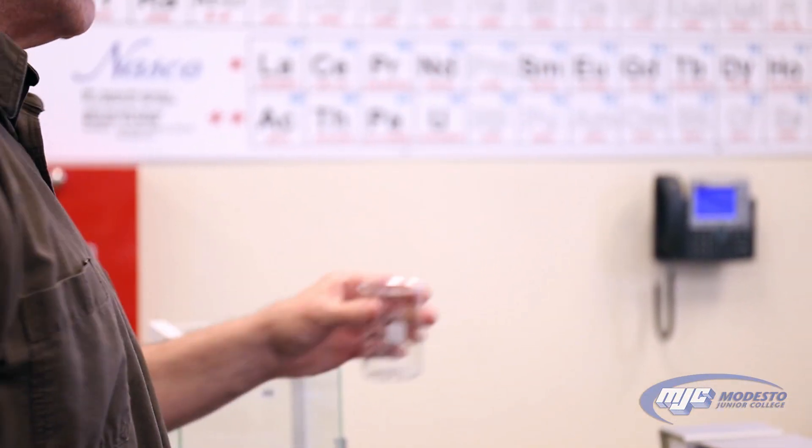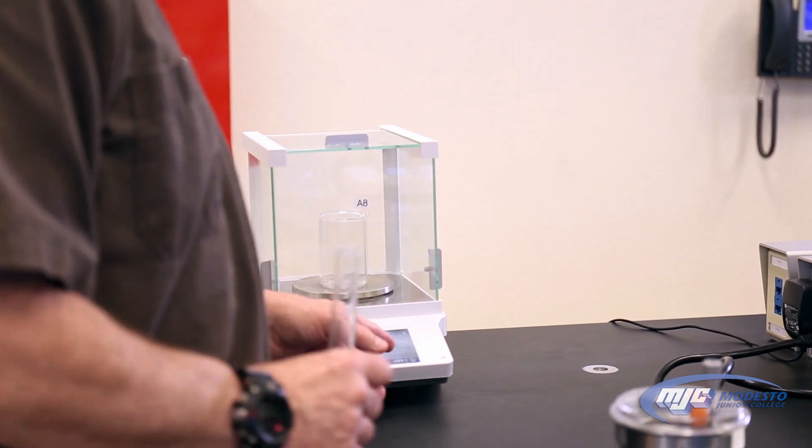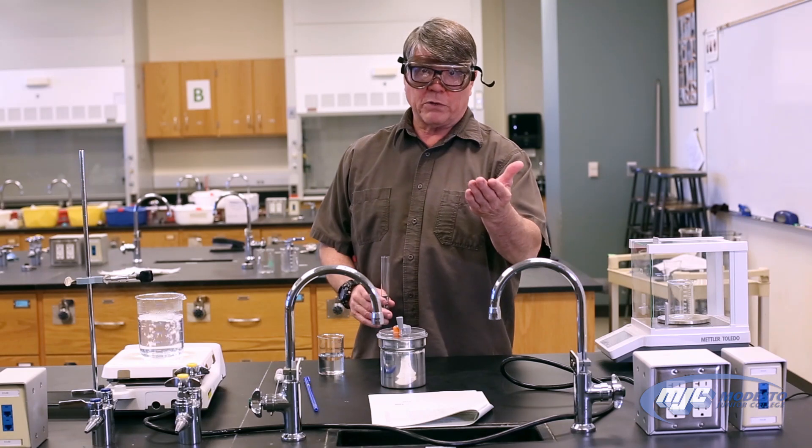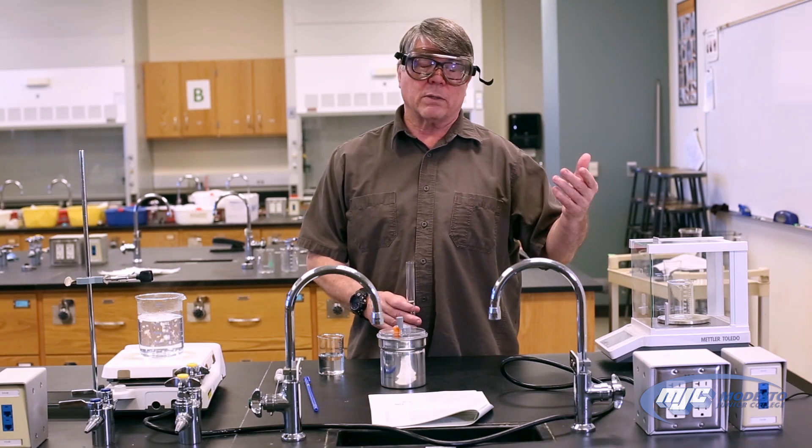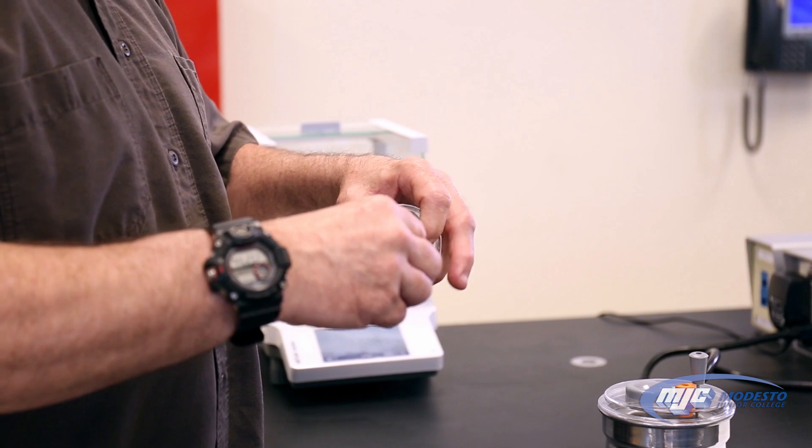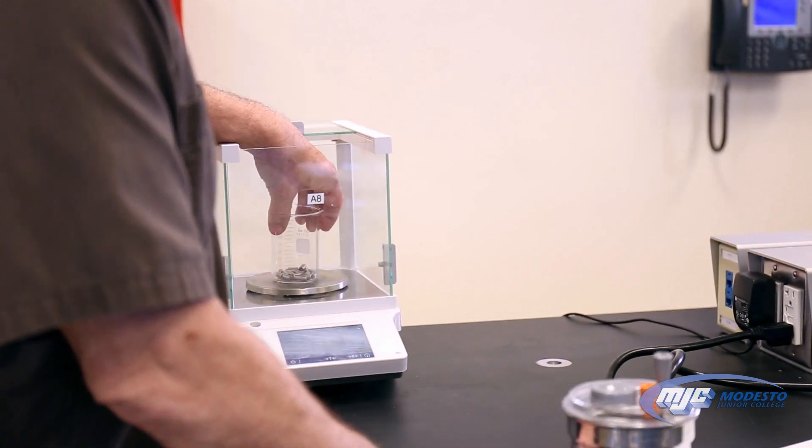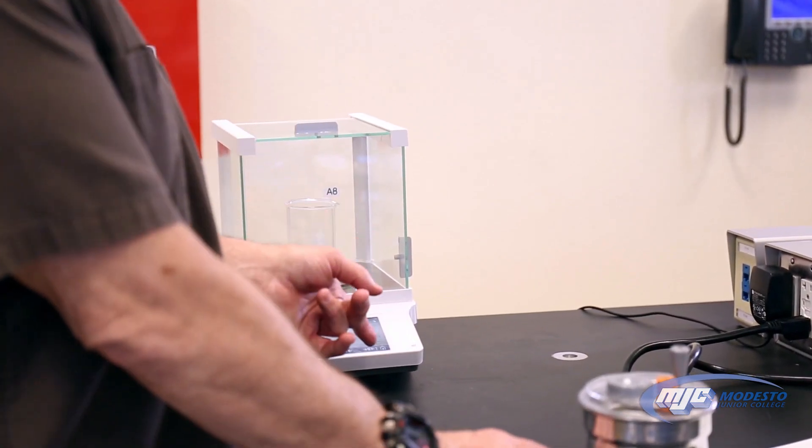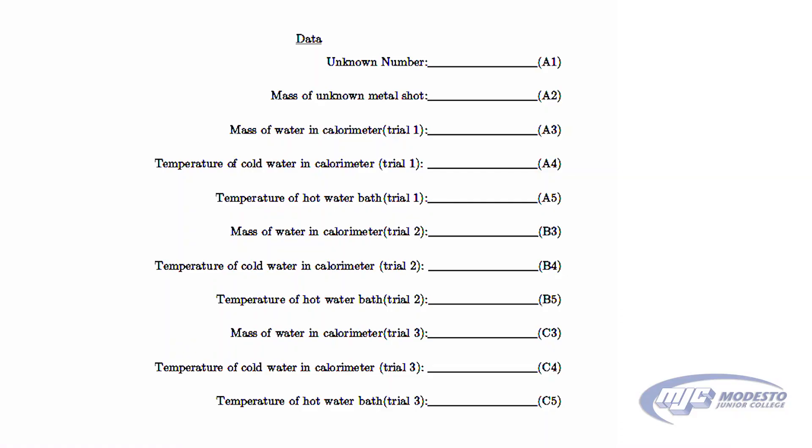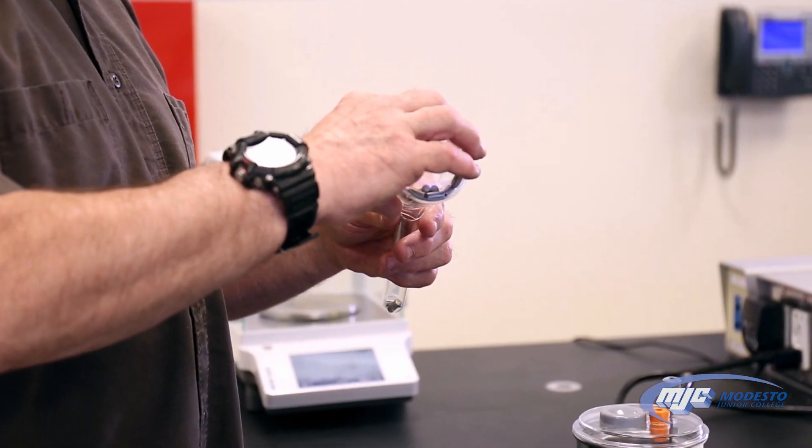So the mass of the metal. What we do is we take a 150 milliliter beaker, put it on the balance, and tare the balance. Should read zero with the empty beaker on there. That way what it's doing is it's subtracting the mass of the beaker for us. So we take the beaker off because we never pour anything directly under the balance. And carefully, so as not to break the beaker, we pour the metal shot into the beaker. All the metal shot. Put it back on the balance. And that number that we read there, it's the mass of the metal. And that's going to be your A2 in your data table. Once we have that, take it out and again carefully pour the metal shot back into the test tube so we don't break the test tube.